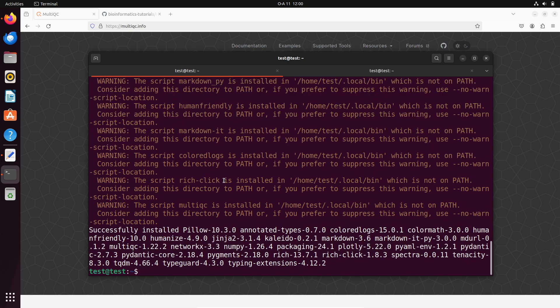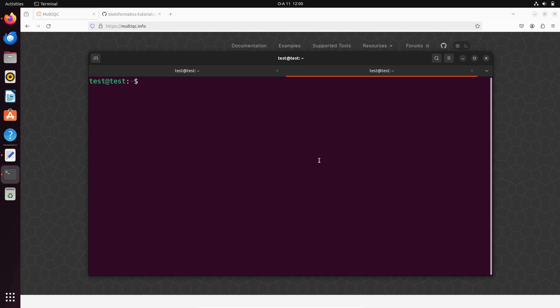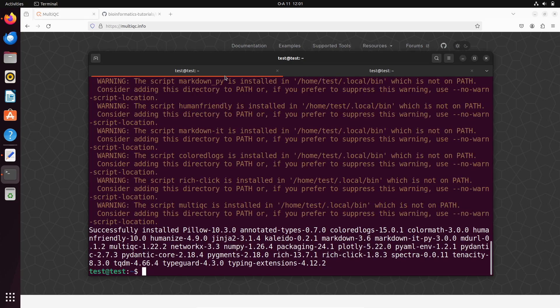It's happening because we need to add the installation directory — the directory where the files have been installed — to our environment. Because we are yet to do that, bash still can't find multiqc. We need to work on that. Let's clear the screen and proceed.